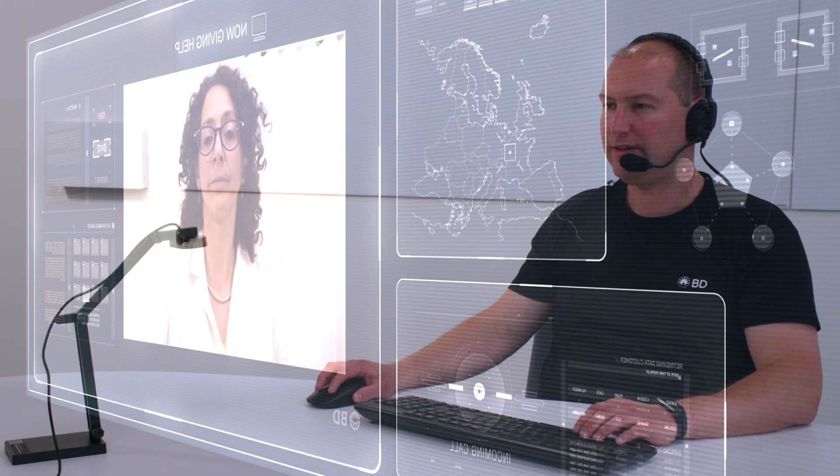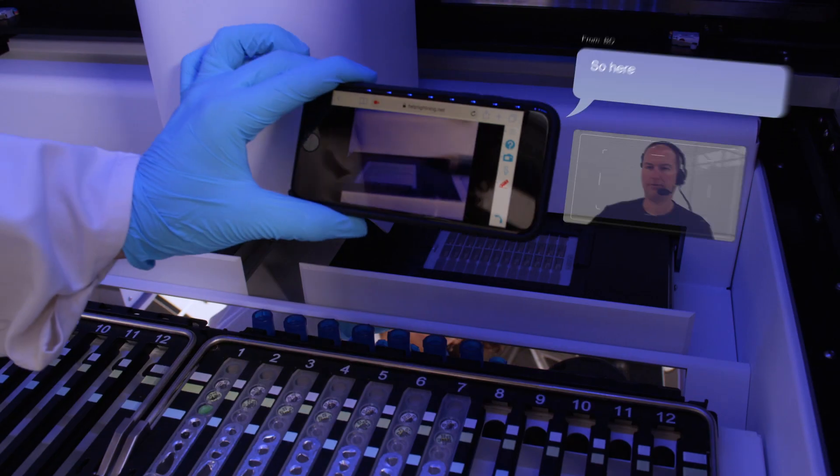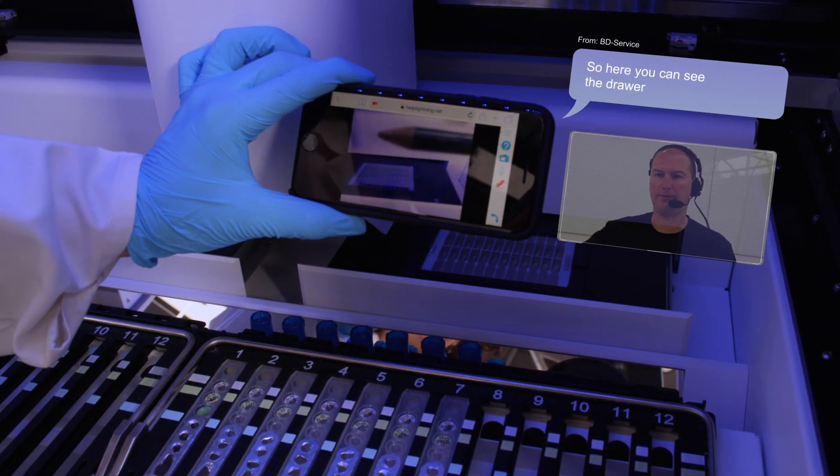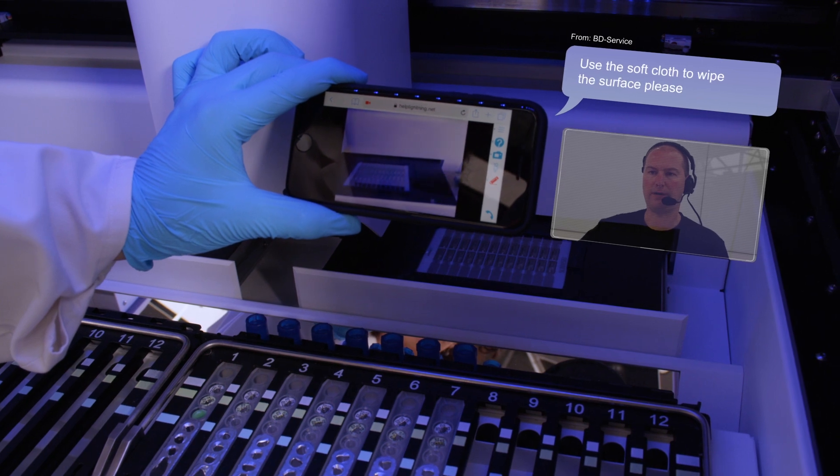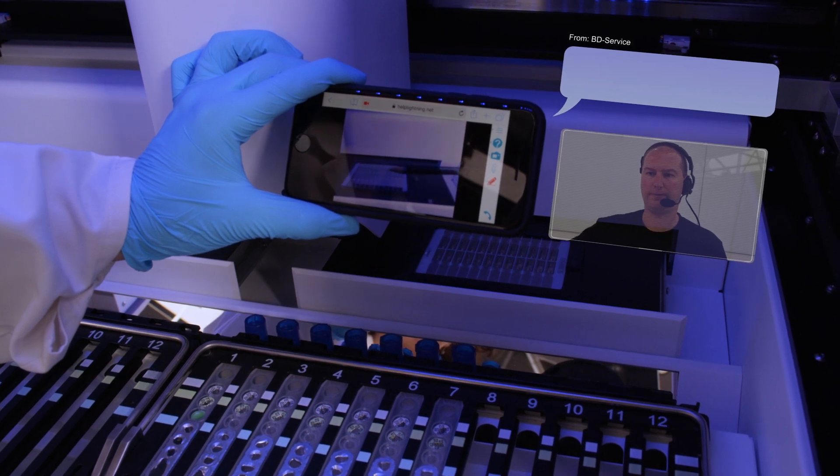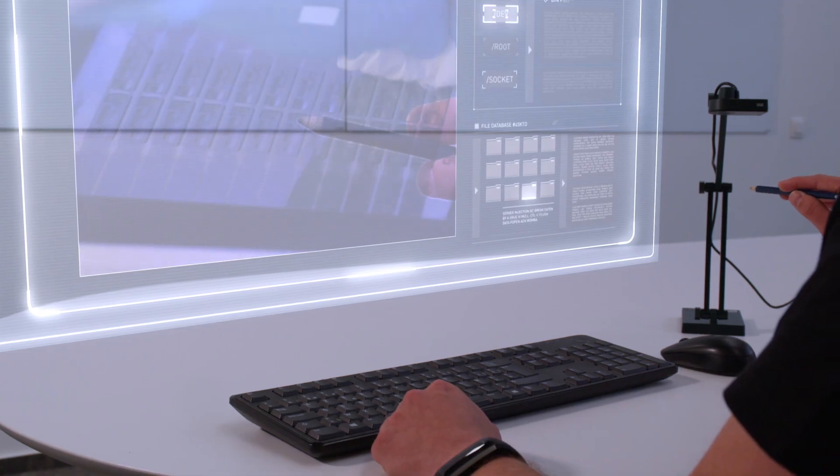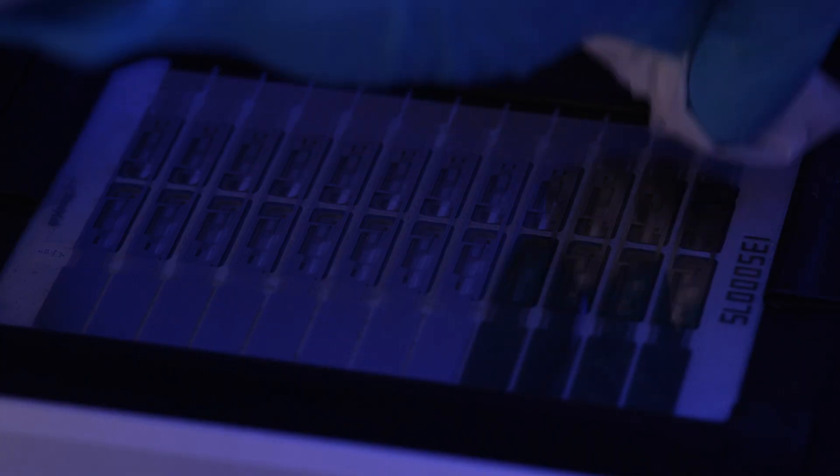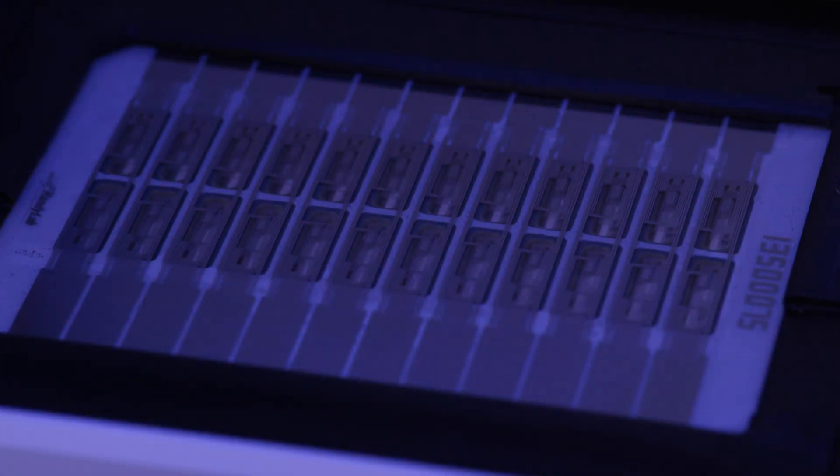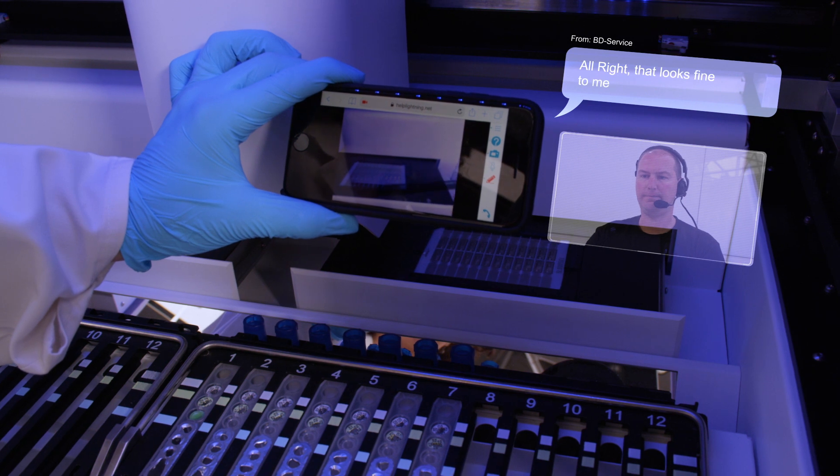Can you switch the camera so that the drawer is visible, please? So here you can see the drawer. Use the soft cloth to wipe the surface, please. Good. Please make sure no residue is left on the drawer. All right, that looks fine to me.